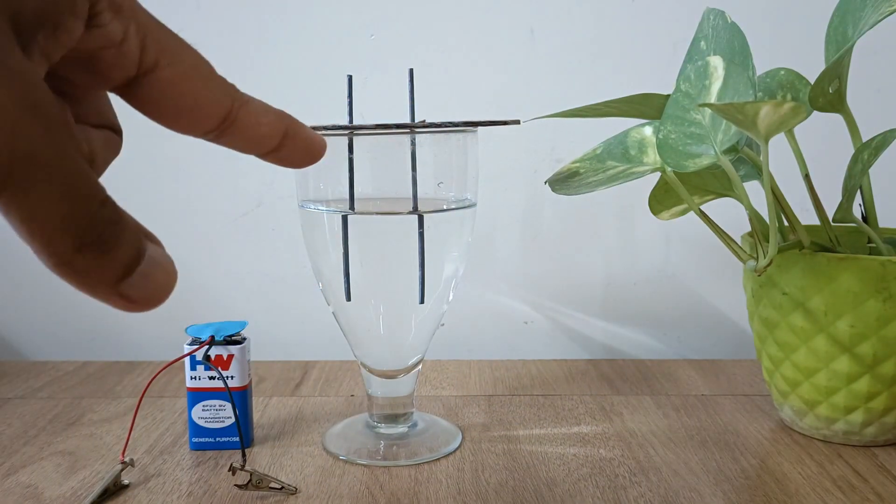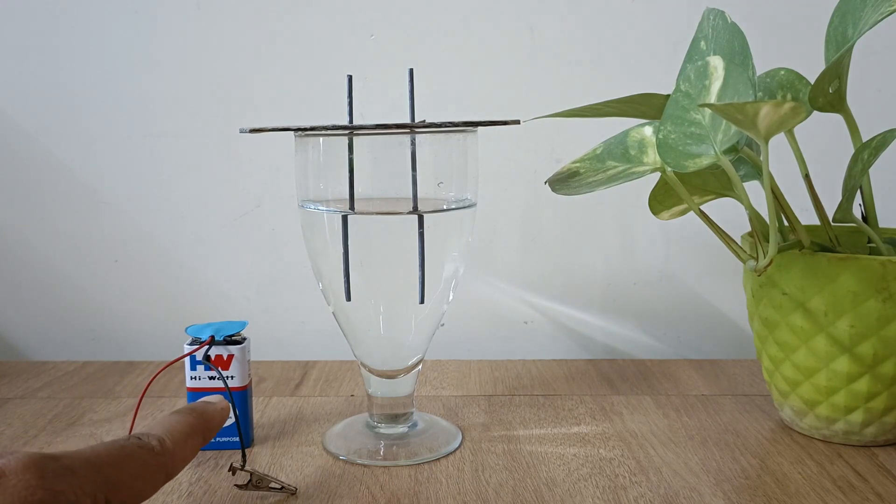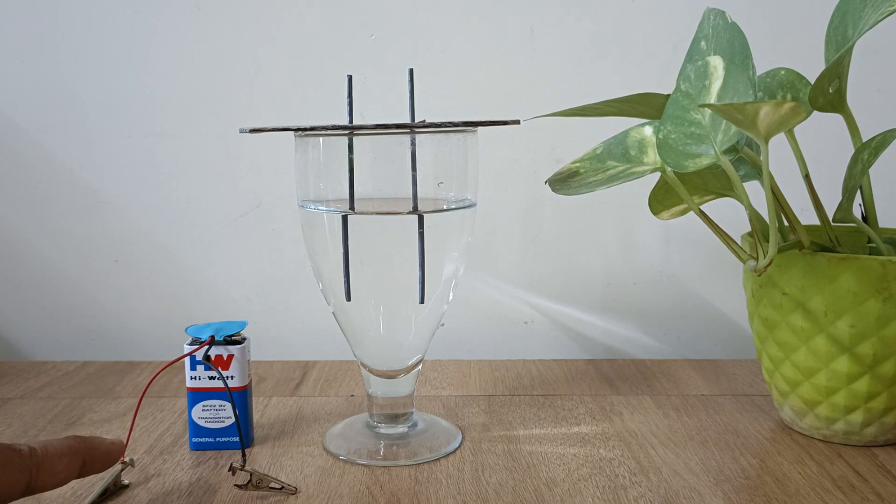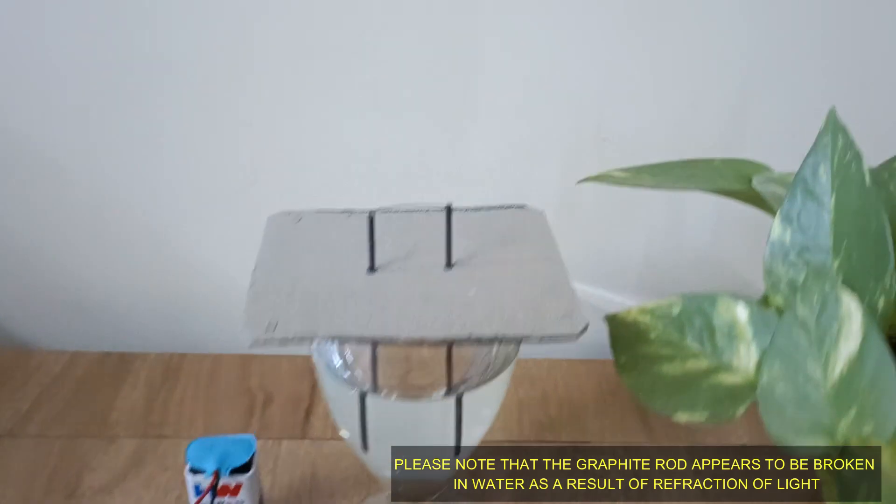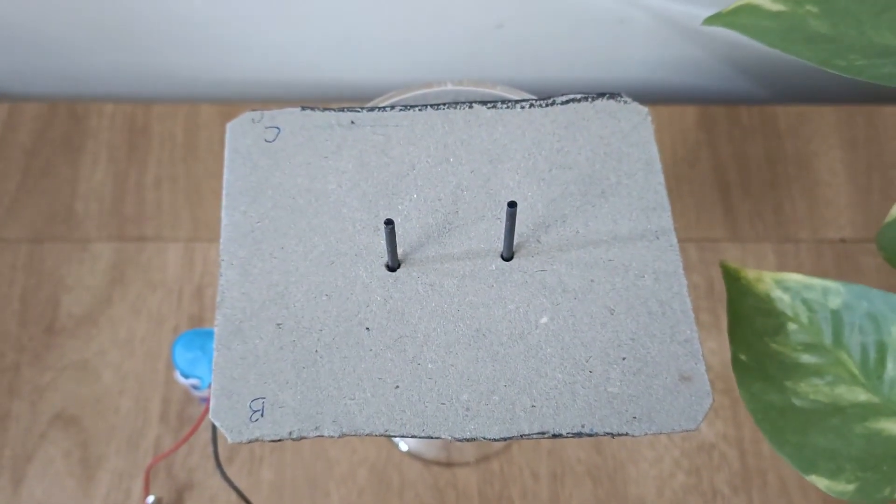Here there are two graphite electrodes. This is a 9 volt battery. The black wire corresponds to the negative terminal and the red wire corresponds to the positive terminal of the battery. This is a small piece of cardboard on which two holes are made such that both electrodes can pass through them easily.